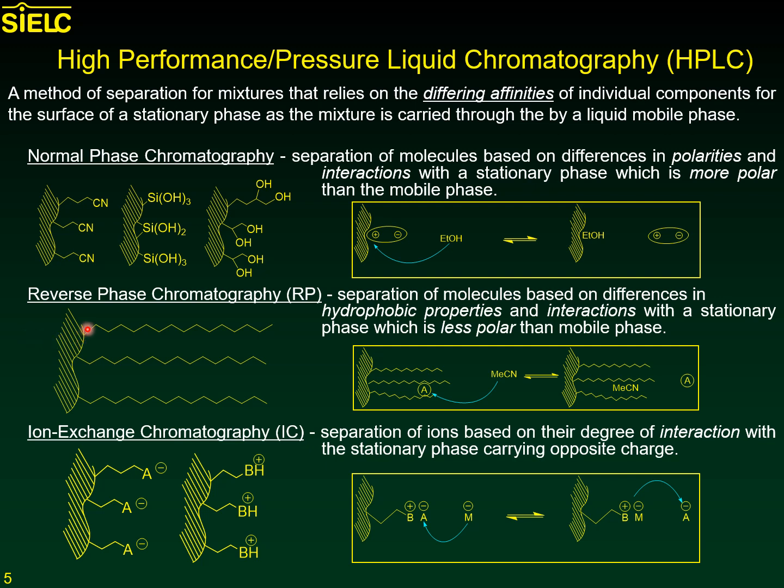Herein, your stationary phase is now mostly nonpolar, as it is composed of long alkyl chains. And your solvent, that is your mobile phase, is going to be more polar than your stationary phase. The dominant mechanism for separation here are hydrophobic interactions.